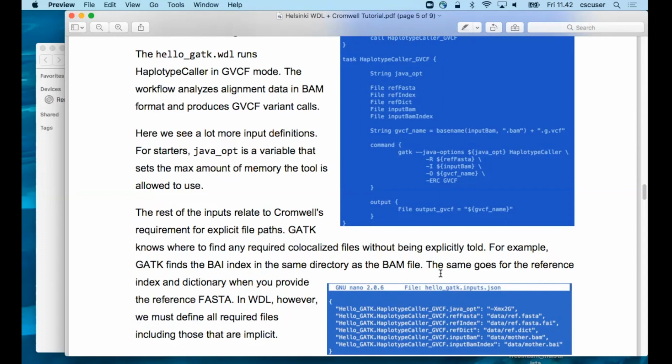That you can do by defining the variable type. Depending on how you set up your script, the JSON needs to match. For example, if you have multiple lanes for read one, and instead of one file you want to give it an array list of files, you can do that. You just give it in an array format with square brackets.